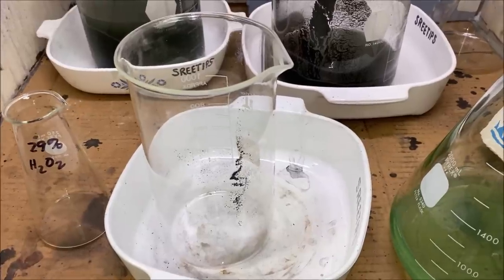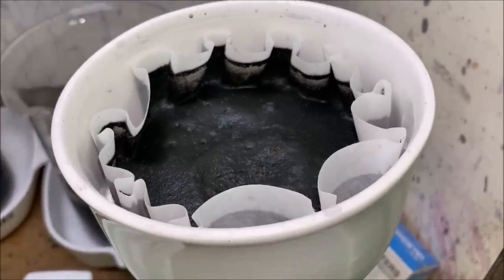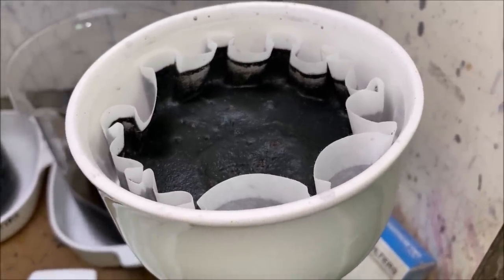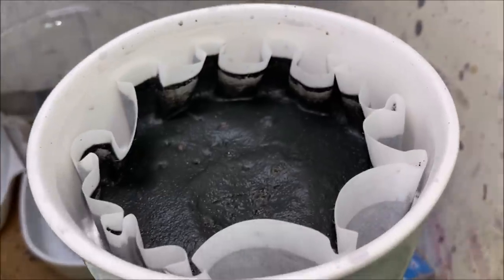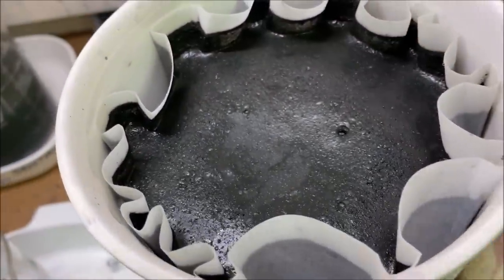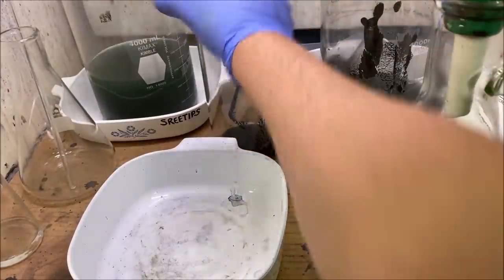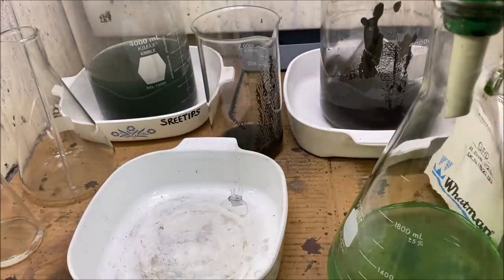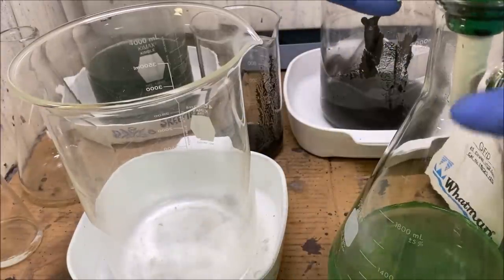When we come back to the next shot, I should have all of the solids up in this filter, or possibly another one, because it looks like this is getting full. Got the liquid pulled out of these solids. What I need to do now is transfer the solids in this funnel to a beaker.